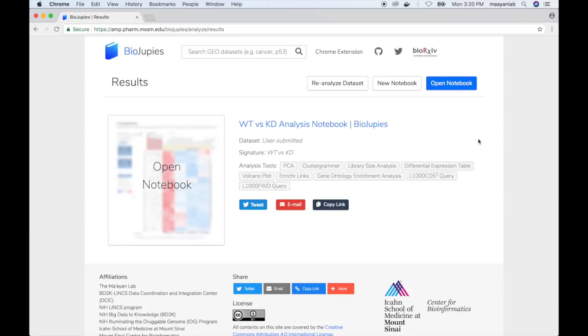Once the process is complete, a link to the notebook is displayed on the website, alongside some options to share it on social media, and a summary of the signature and the analysis tools used in the notebook.